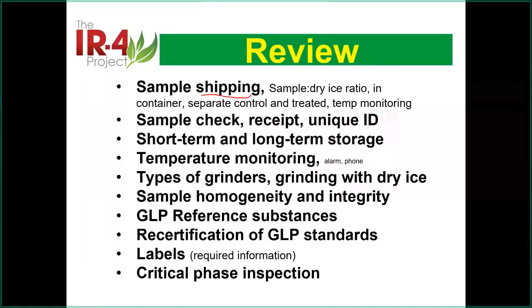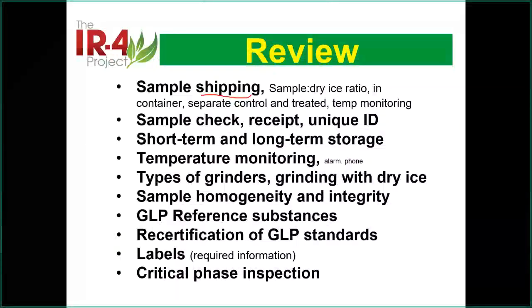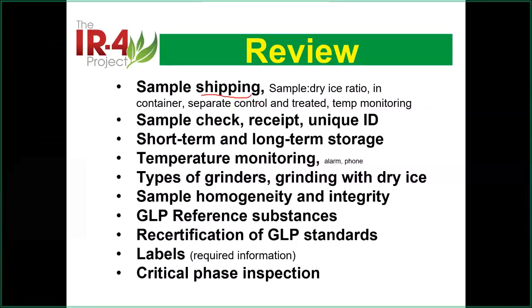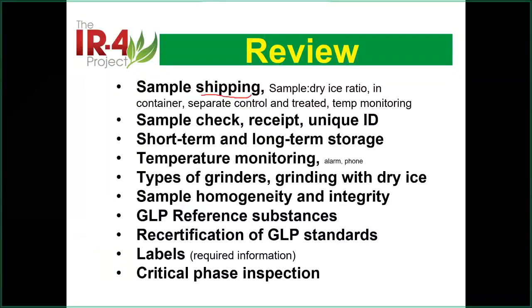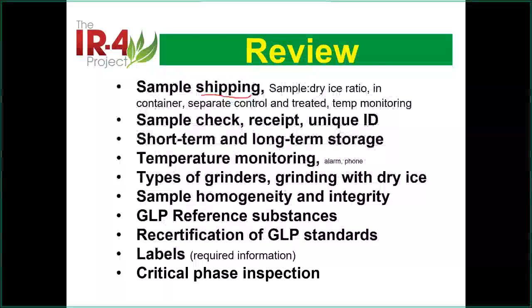So if you need to ship the sample, it depends on the situation. Typically, you put it in the box and you can ship that. For example, if it is the ACDS truck we have, which is the freezer truck, that's okay because they do have the required freezing truck to do the work, and they have enough resource to do so.